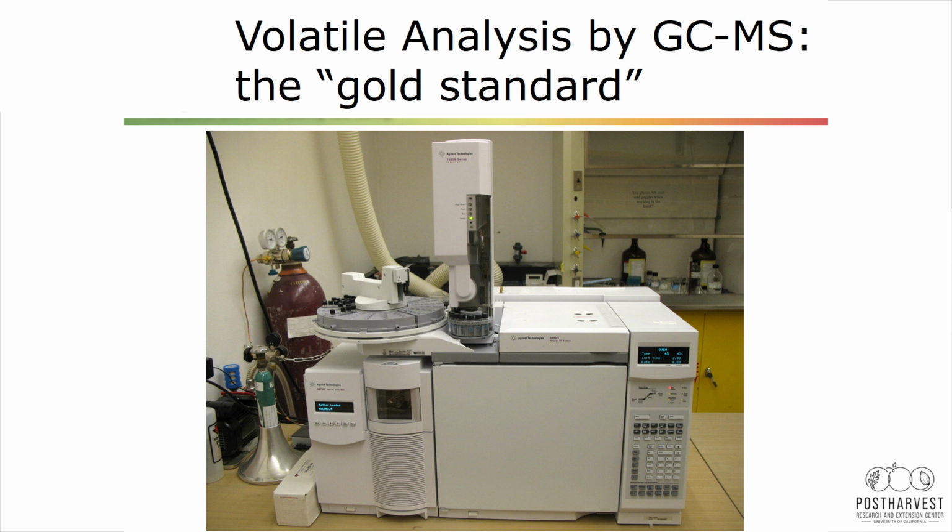How do we measure those? We measure those with a GCMS, and that's this instrument. It's super big, it's super expensive. You need a PhD to operate it, kind of, maybe not. That's the GC part, that's the MS part, but that's really the gold standard. And this is why, unfortunately, aroma is not really part of any QC program, because it's really hard to measure it.